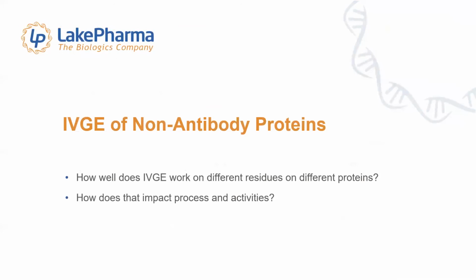Last part of my talk would be on IVGE on non-antibody proteins. The data I just showed you all was with IgG1 or IgG4, where the glycosylation is perhaps simpler. So we have been doing IVG on a number of non-antibody proteins, where they have multiple glycosylation sites, and the processes are also very different from IgG.